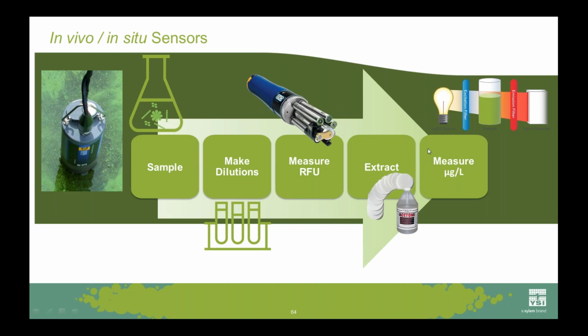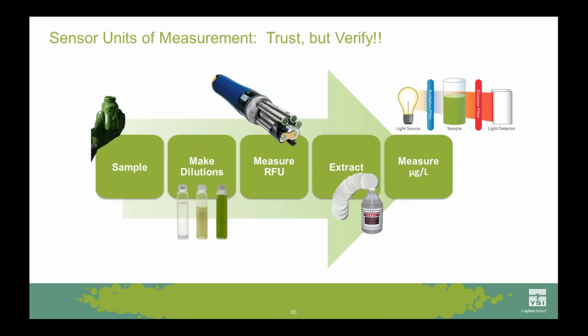So I strongly advise that if you plan to use the part per billion unit delivered by an optical sensor, whether it's a YSI optical sensor or anybody else's, you ground truth that measurement and make sure that it really does align well with the samples from your environment. In fact, that's exactly what my friend James Chen did. James works in China. James is one of our fantastic application engineers there in our Beijing office.